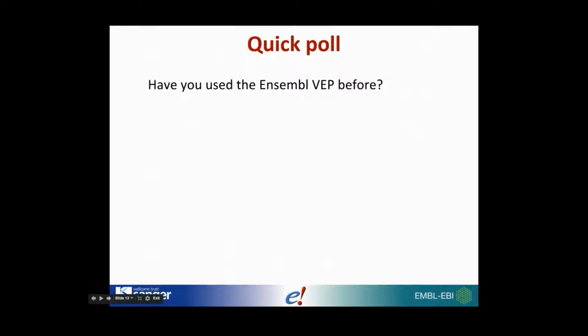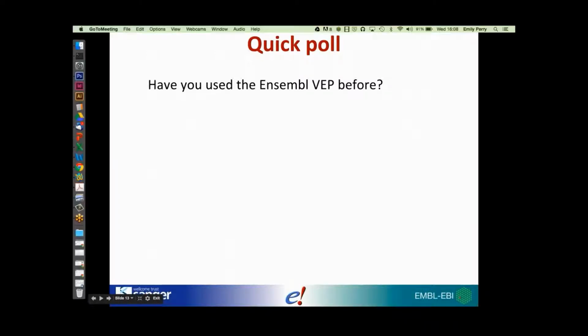I'll do another quick poll, if I can make this launch. Have you used the Ensembl VEP before? And we'll see how many of you have worked with this.